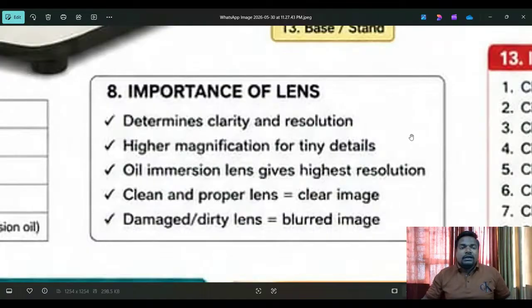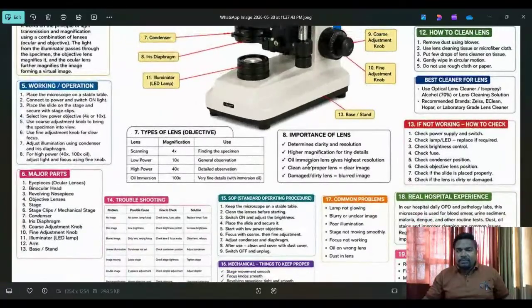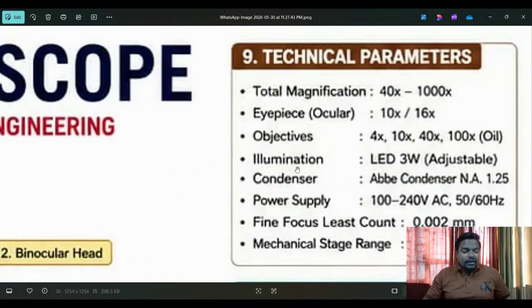This is the eighth point, and it is completed. Next we will go to the ninth point. Come with me, see very clearly, for learning purposes. Proper guidance, proper explanation and proper practice are very important. For every biomedical engineer, listen carefully to what I'm saying. Time is very valuable, so try to focus on learning these skills, whatever you need to become a good biomedical engineer.